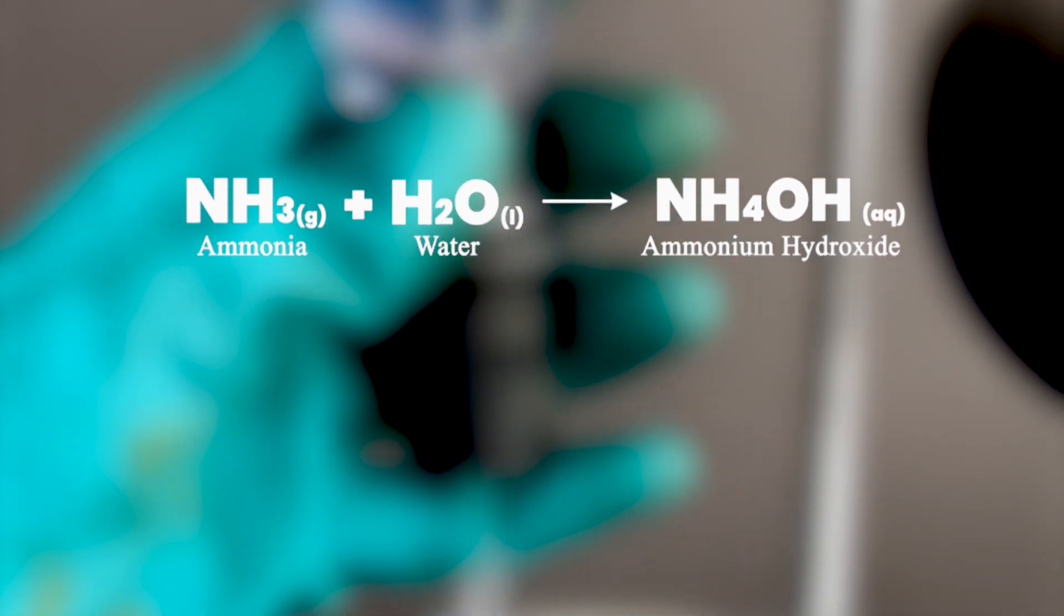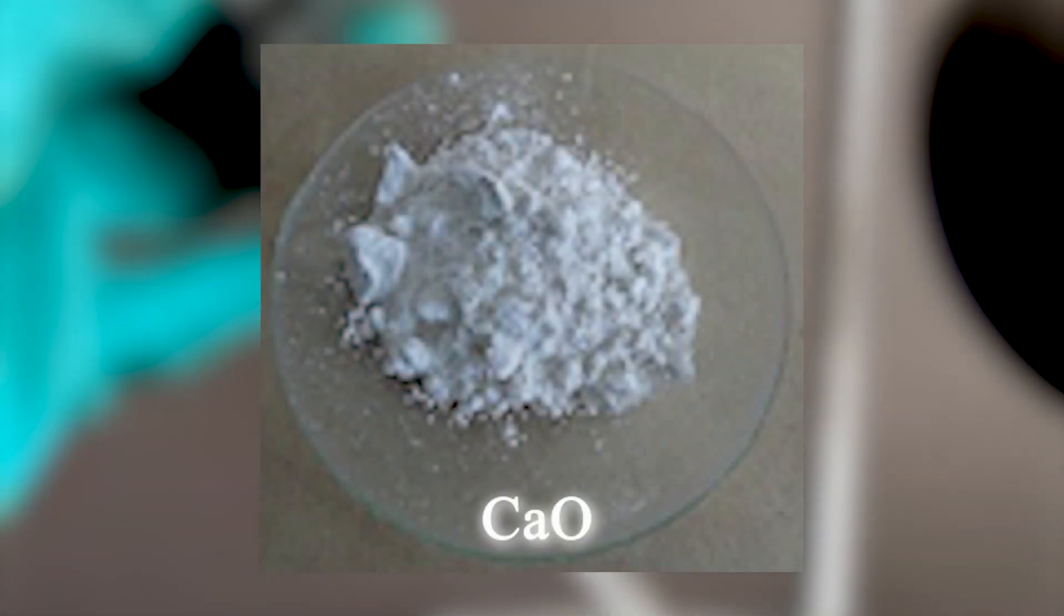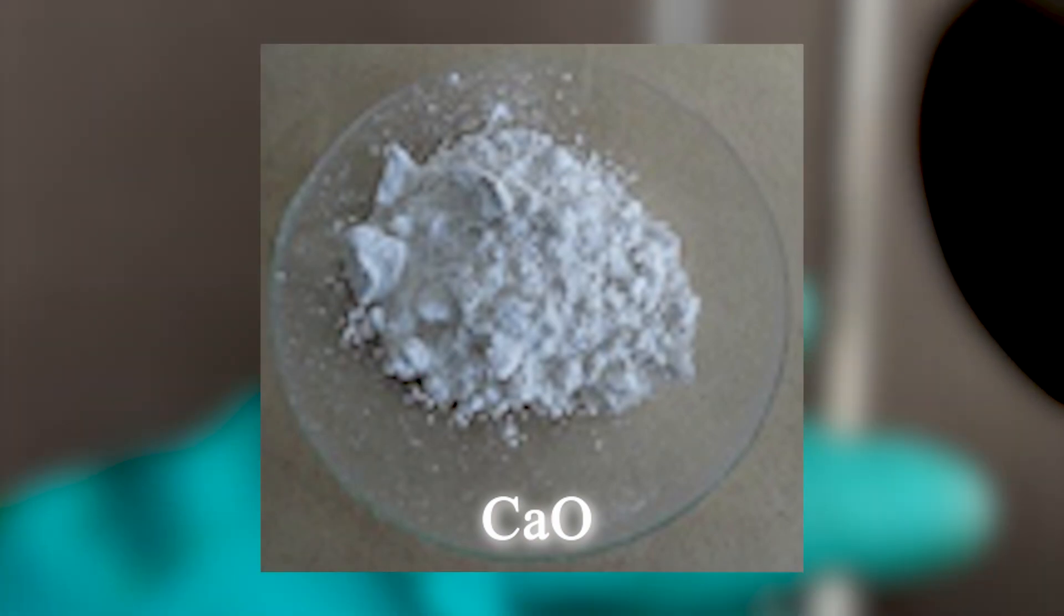Therefore, resulting in too little ammonia to make a reaction feasible. As a drying agent, I chose calcium oxide due to its property of not reacting with ammonia.